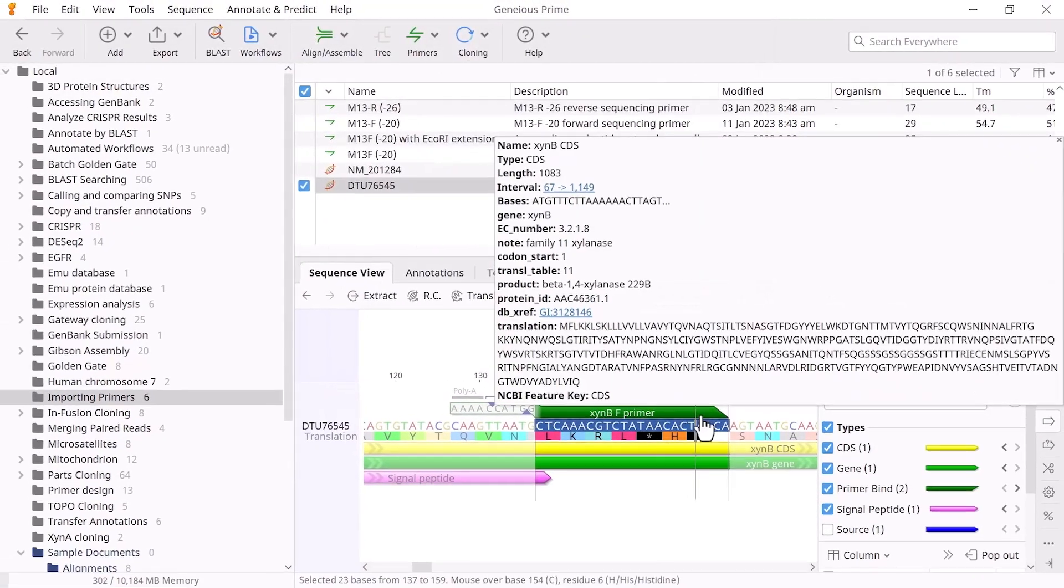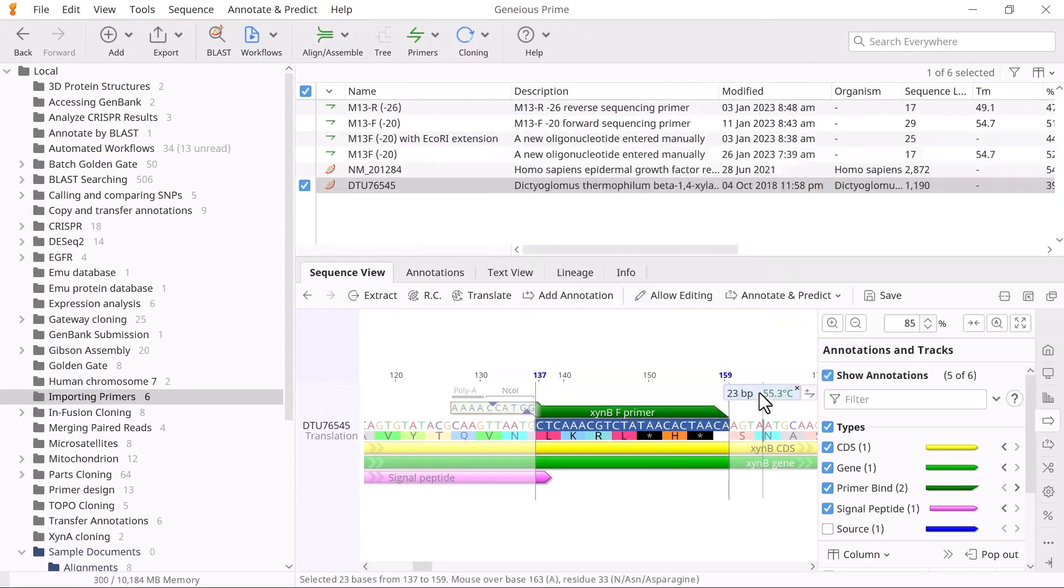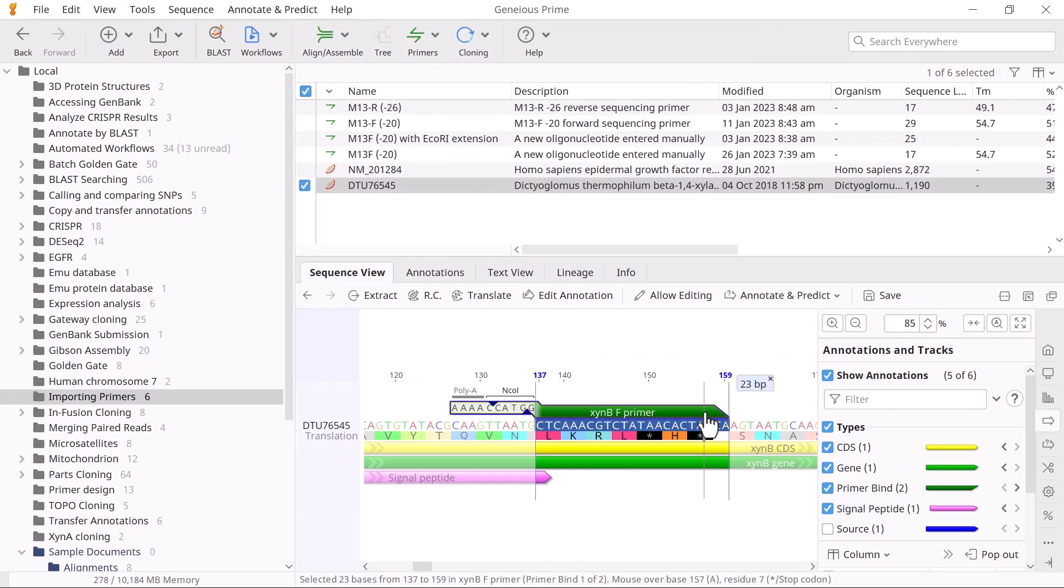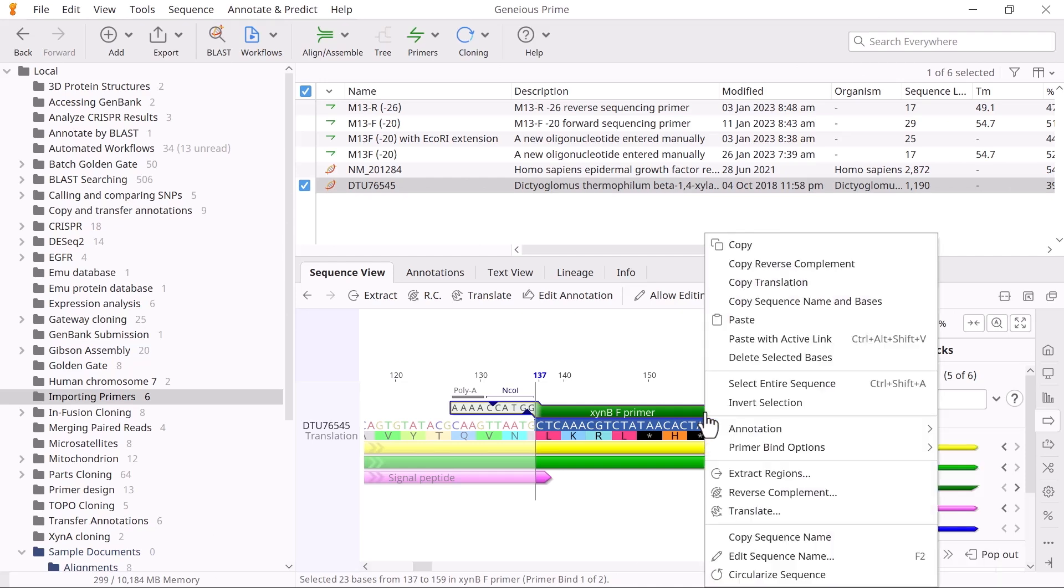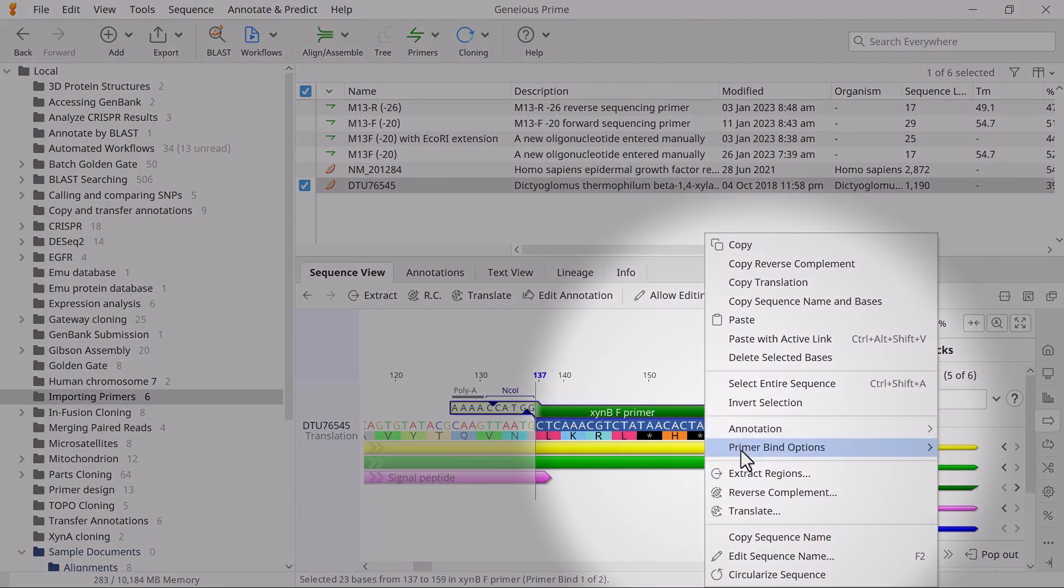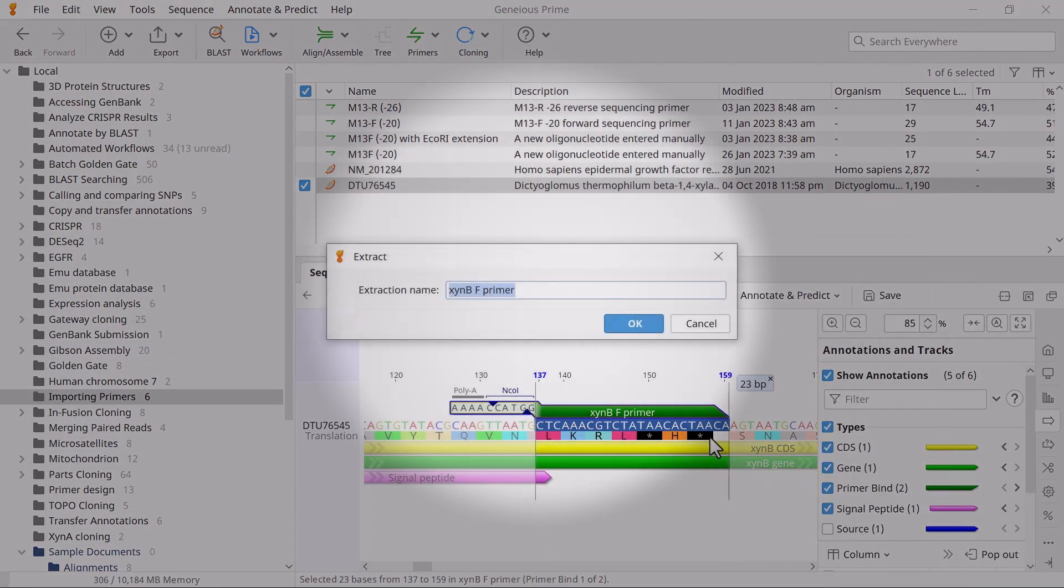You'll see the new primer annotation added to the sequence. If you want to save the primer annotation as a new primer sequence, simply right-click it and select Extract Regions. Then give the file a name and click OK.